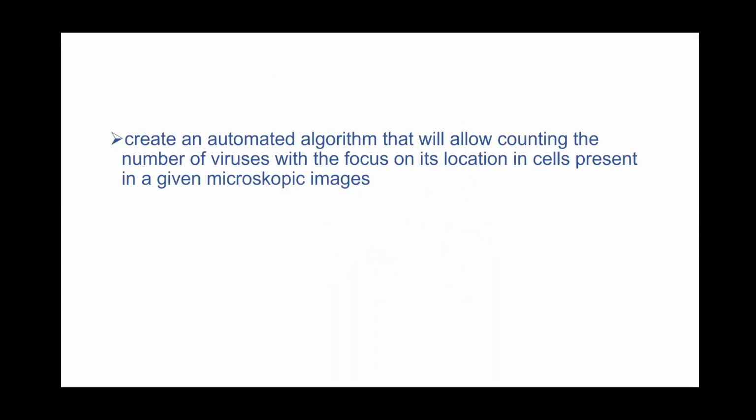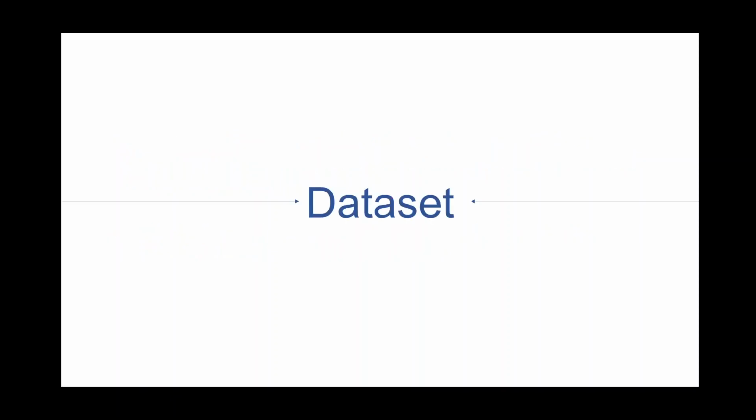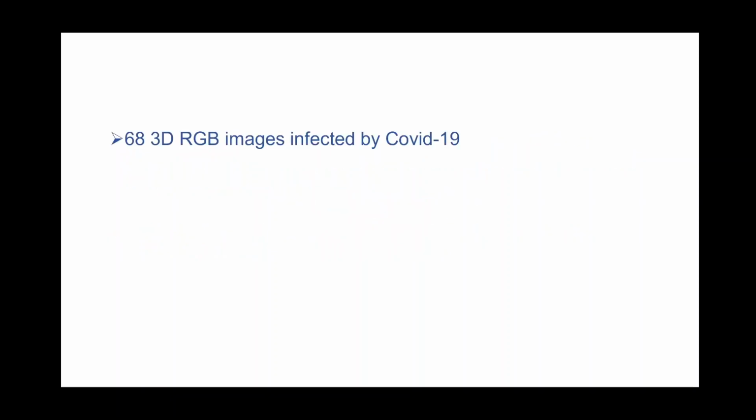So, as the topic of my presentation says, the goal of my research is to create an algorithm that will count the number of viruses in cells with a focus on their location. So that means that we want to count the number of viruses inside the cell and also outside the cell, very close to its border. And as I've mentioned before, it is a time-consuming process for scientists in laboratories, so I hope it will facilitate their work.